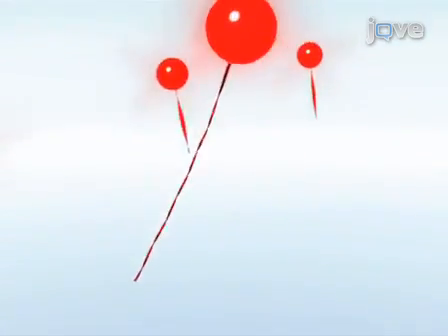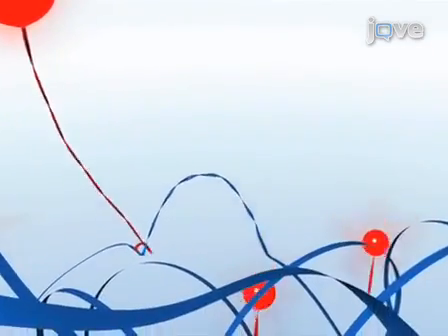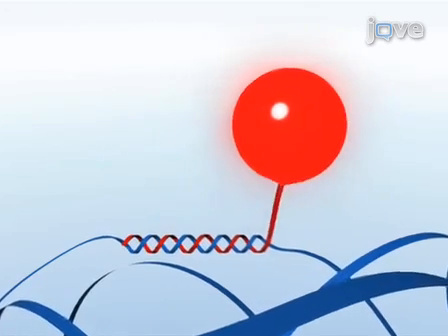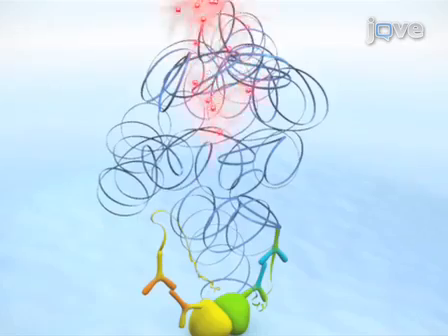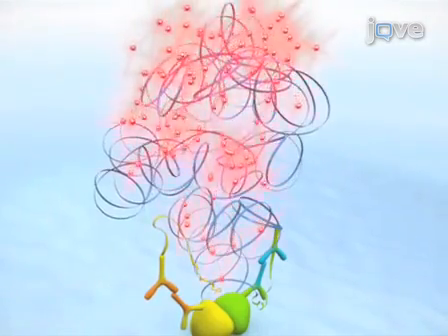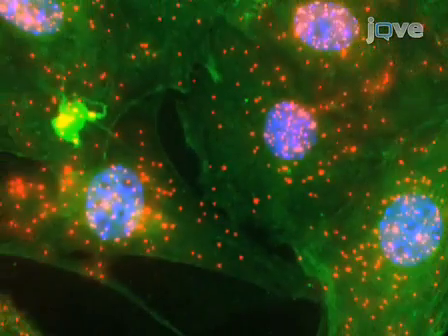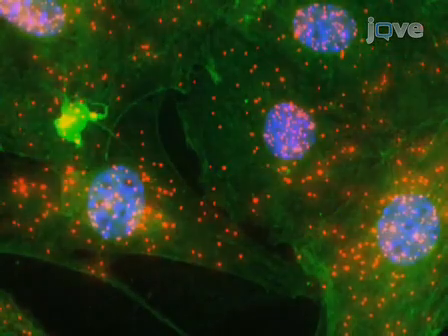After the amplification reaction, hybridization of labeled complementary oligonucleotide probes highlights the product. Fluorescent spots associated with the amplification of each circularized DNA product are easily visible when viewed under a fluorescence microscope. The spots correspond to complexes between effector SMADs and SMAD4, which signify active BMP signaling in the cell.